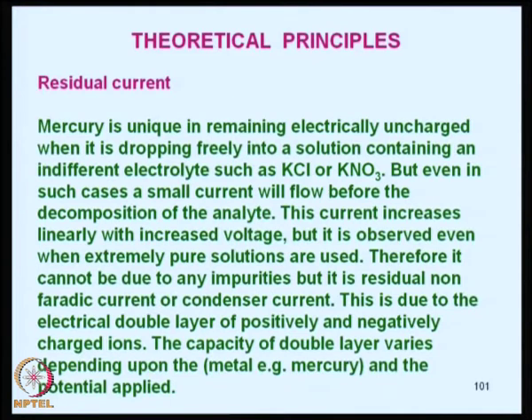So, let us look at the theoretical principles of polarography. Now that you have seen how a polarograph looks and what is happening at the electrodes, you know the working range of the polarograph. Yes. Then let us look at the theoretical principles. One thing you should understand is what we mean by residual current.